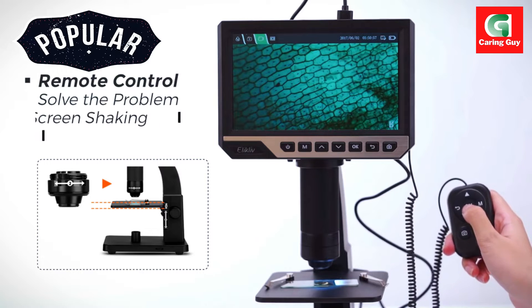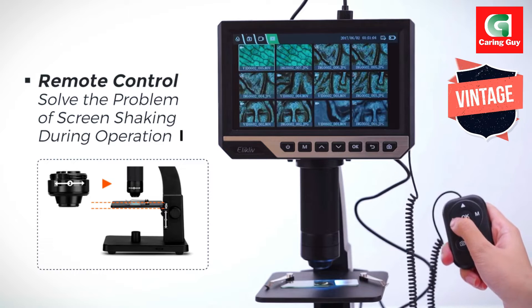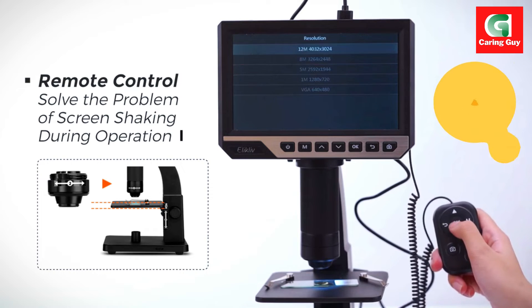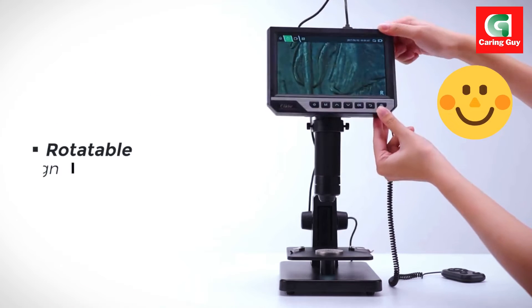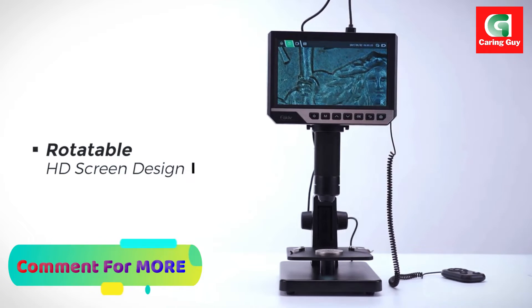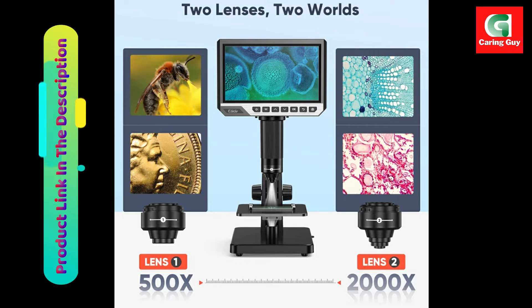For microscopic observations, the microbial lens with a range of 100-2000X, referred to as Lens 2, allows users to explore cells, micro-organisms, and slides. This dual lens setup enhances the microscope's versatility across a broad spectrum of magnification needs.